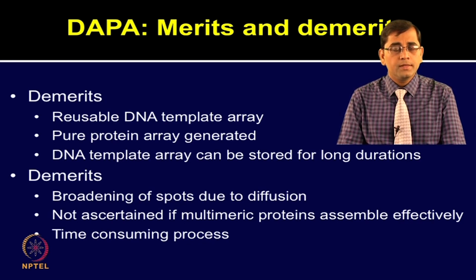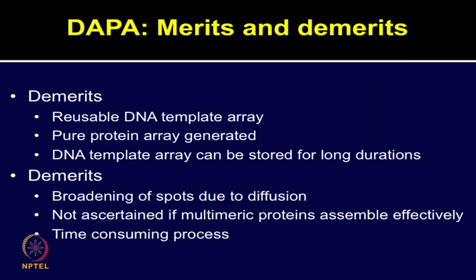However, there are certain limitations of using DAPA method, including the broadening of spots due to diffusion. It is not ascertained if multimeric proteins assemble effectively. It is also a time consuming process.